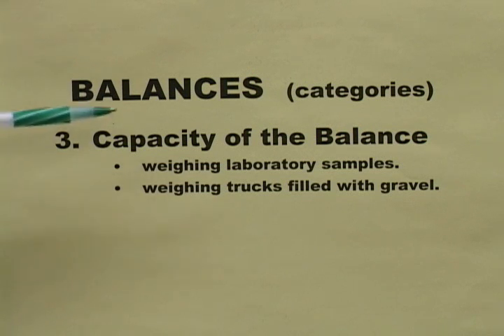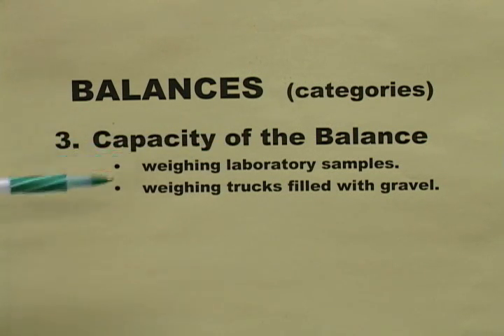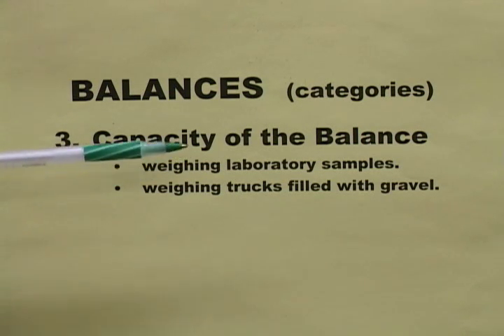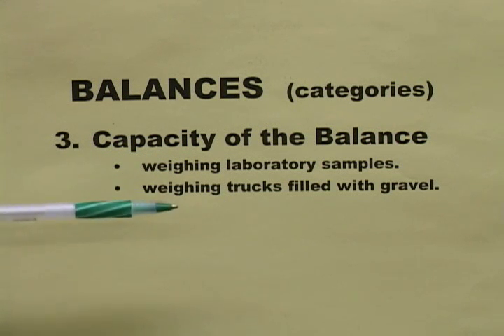Finally, balances can be distinguished by the capacity of the balance. That is, you expect to see a different balance in the laboratory where you're weighing just a few grams or 100 grams relative to weighing a truck filled with gravel.